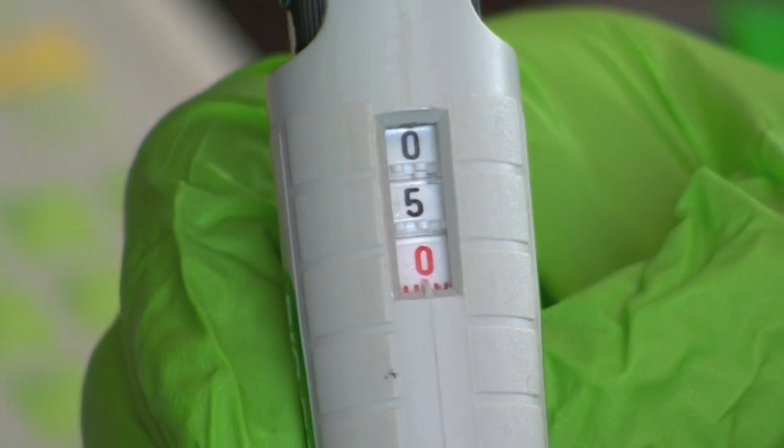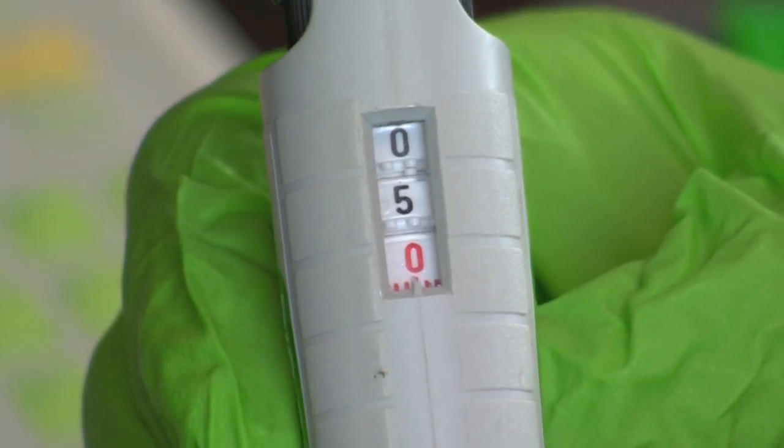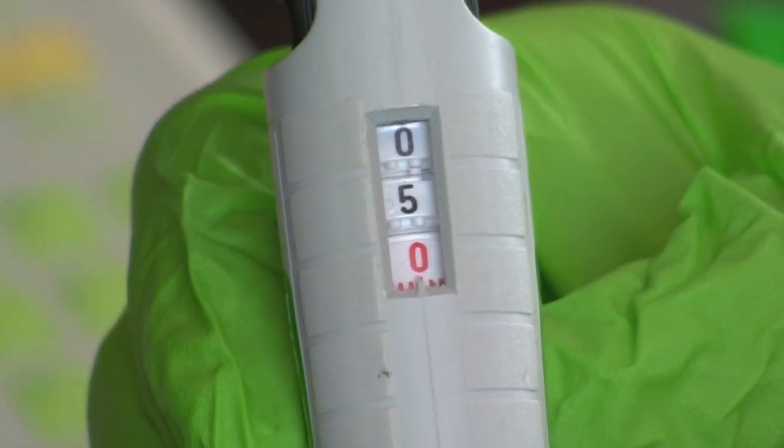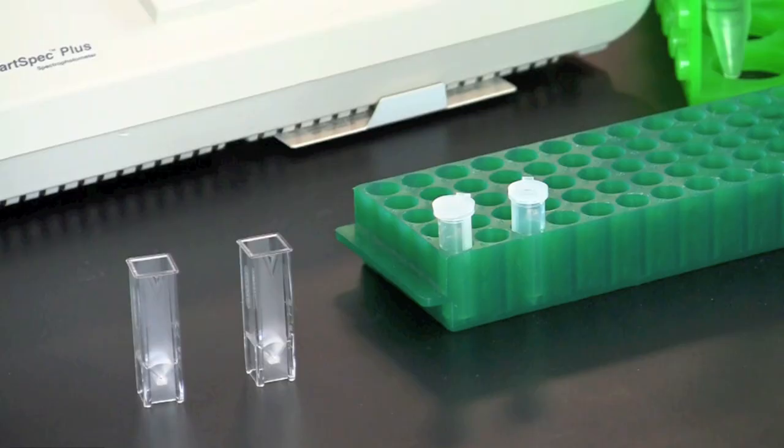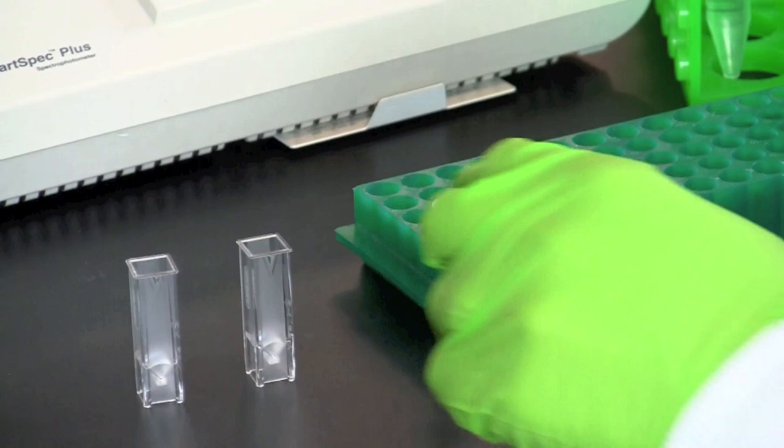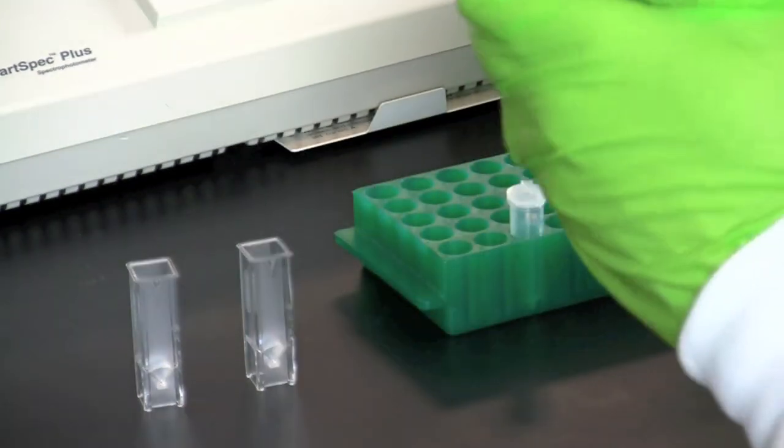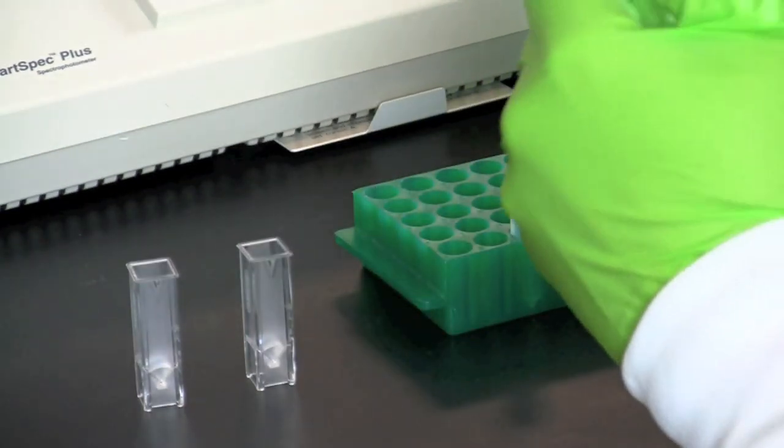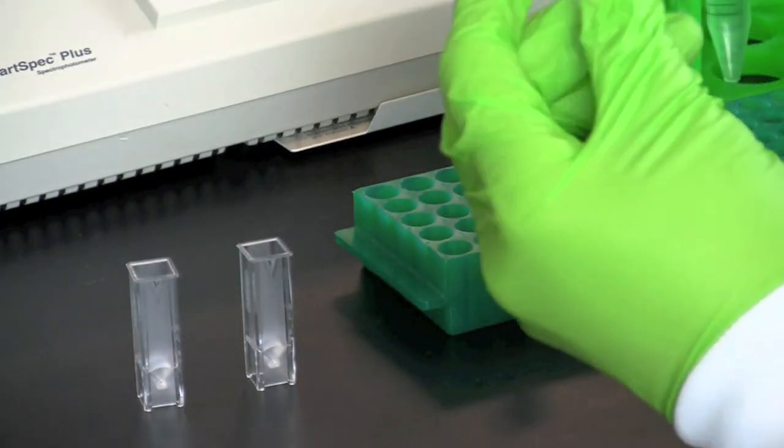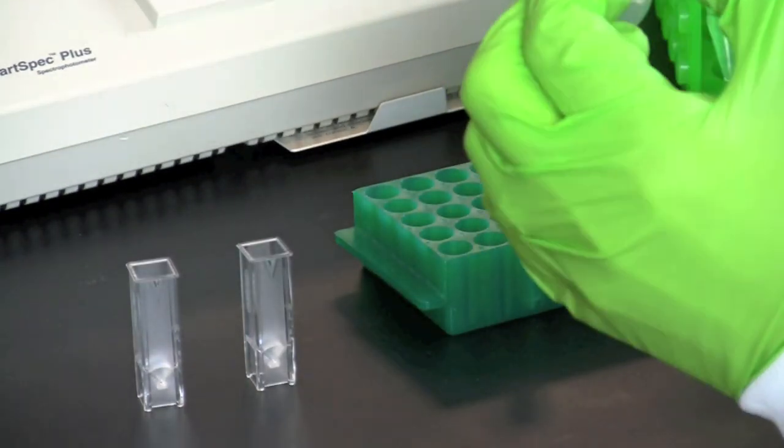Set your micropipette to 5 microliters. Pipette 5 microliters of purified DNA sample into the test cuvette.